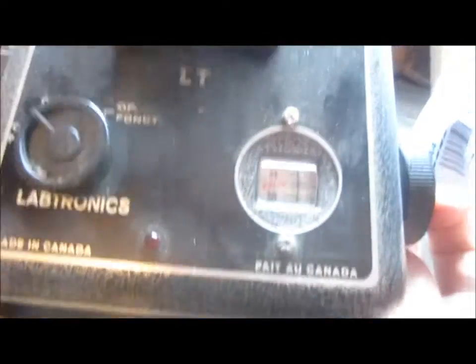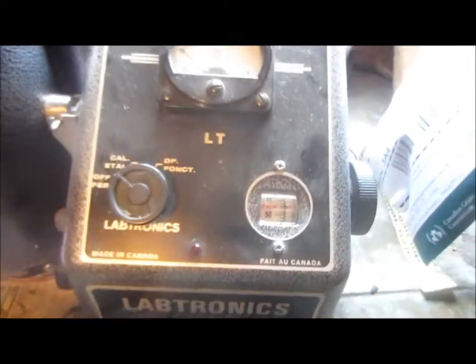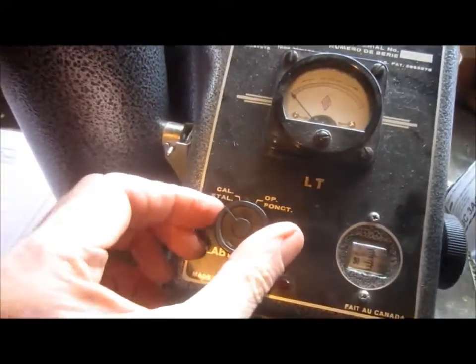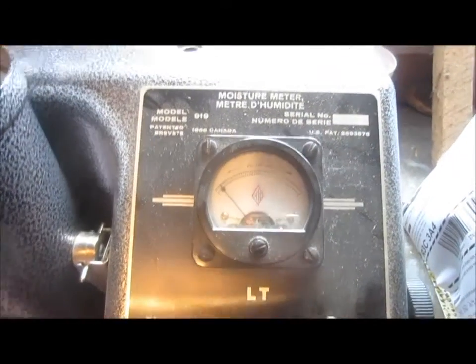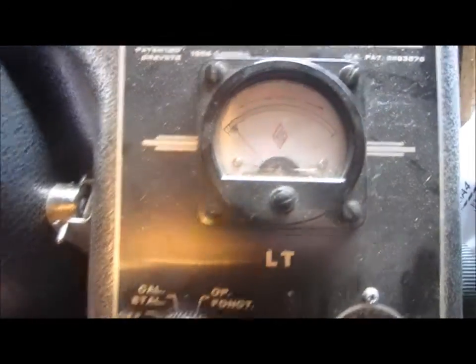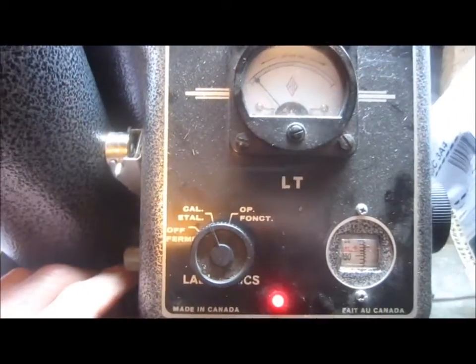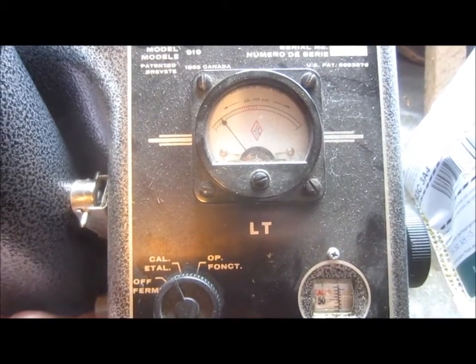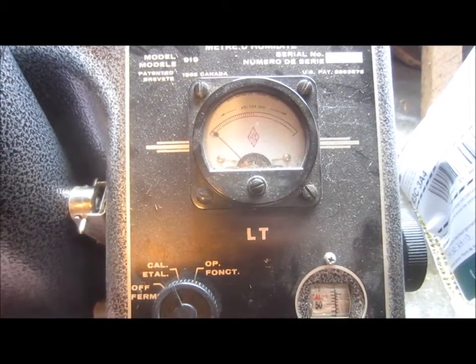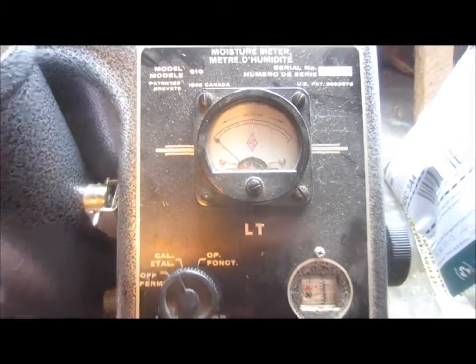Set the knob to the arrow that says 'cal' — that's calibrate. Then you try to zero that needle by rotating the little dial on the left. Turn the other way and that's pretty much zero right there.